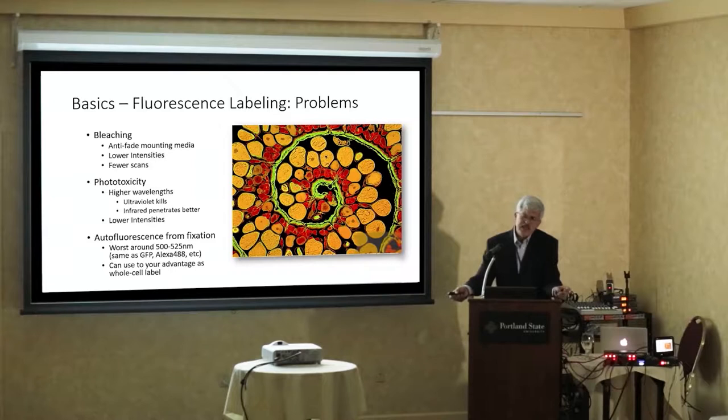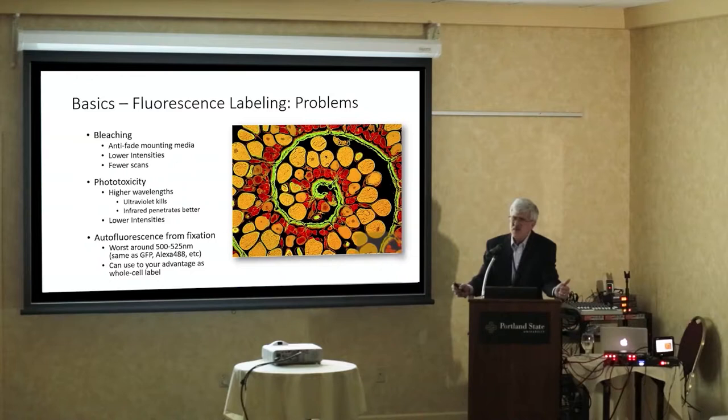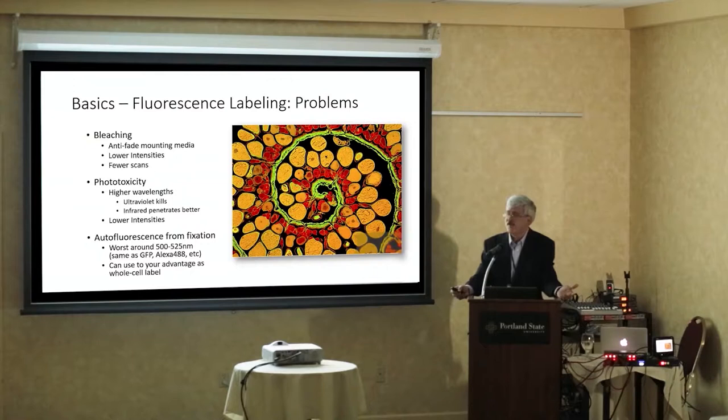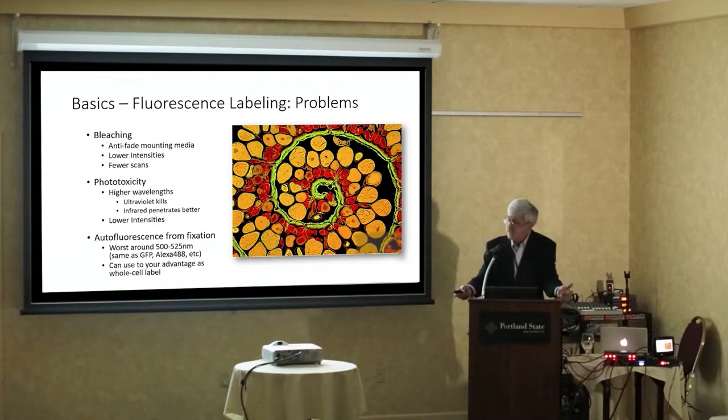When dealing with fluorescence, we have three basic problems: bleaching or fading, phototoxicity, and autofluorescence. With bleaching, if they're fixed cells you can use anti-fade mounting media, but really the only way to control it is to reduce the intensity of the light overall. The amount overall can also be controlled with fewer scans. With phototoxicity, lower wavelengths are not happy for cells — they don't like ultraviolet light, it kills them. So if you can use infrared or farther red, that's going to be happier for the cells. Infrared also penetrates more.